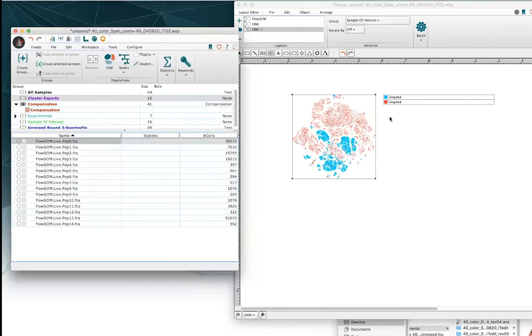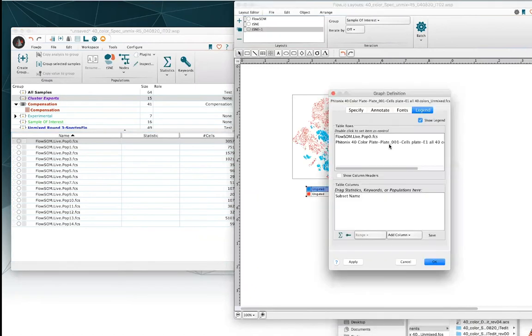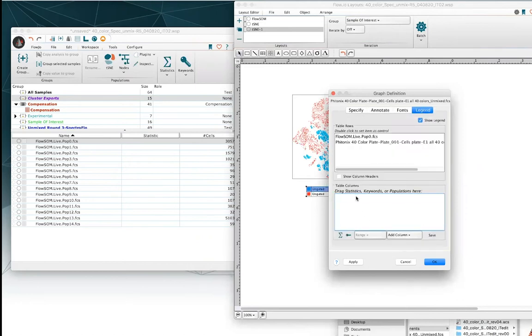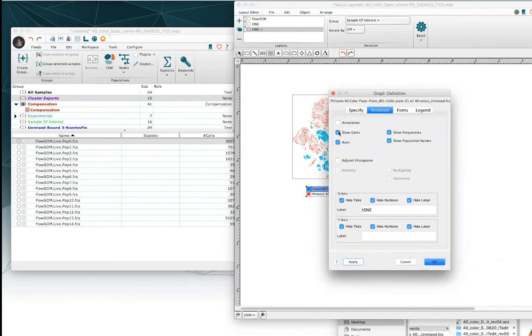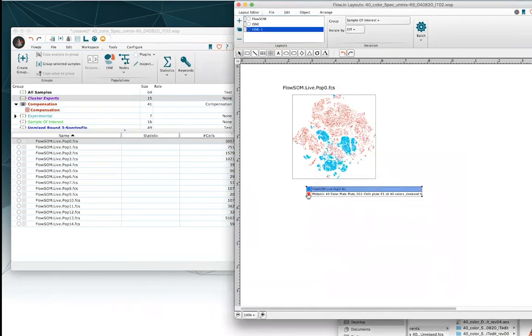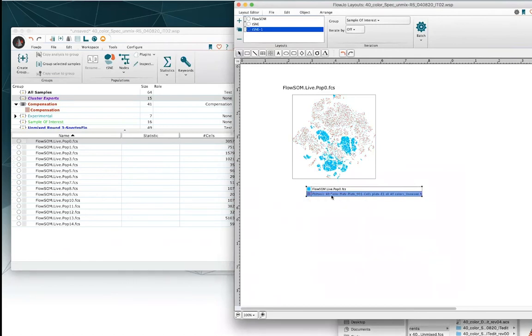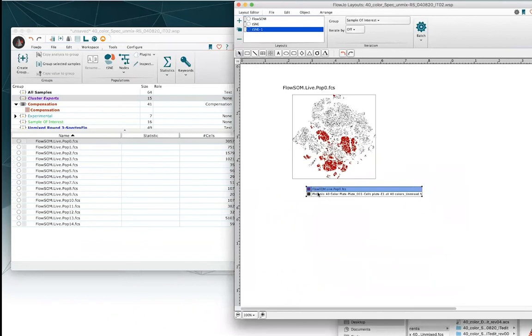Now we've got the overlay of interest — we're actually looking at our two subpopulations of interest. I just need to change my legend section to show the annotations of interest, so not subset name but rather our sample name. I'd also like to include annotations, so I'm going to add that annotation there. And I want to change the colors — in an overlay, to change the colors you just click on that colored swatch and switch the color like so. I'm going to make my background t-SNE a black color, and my population of interest, starting with FlowSOM population zero, a dark red.